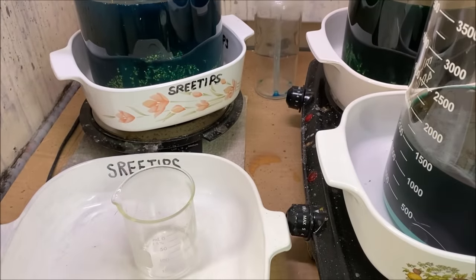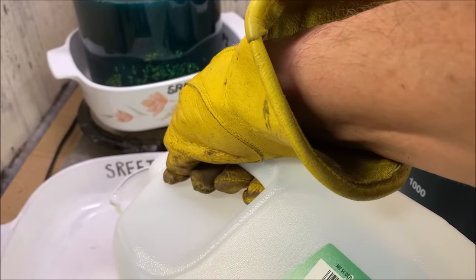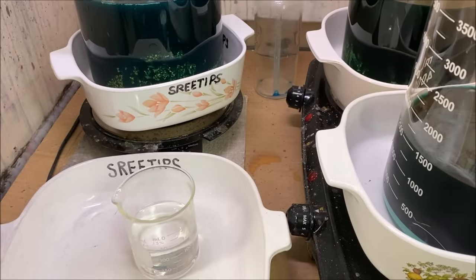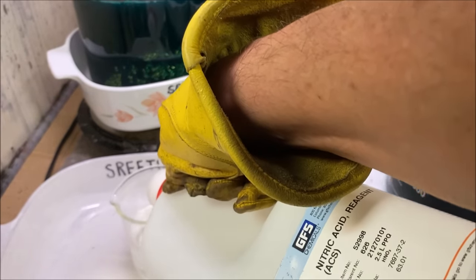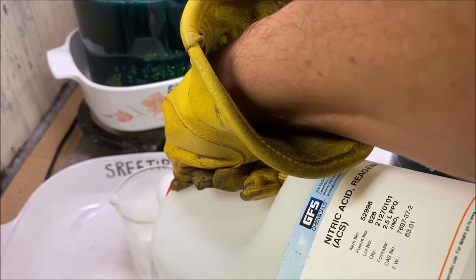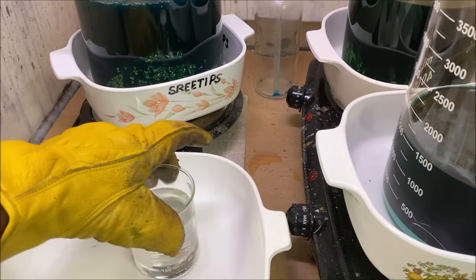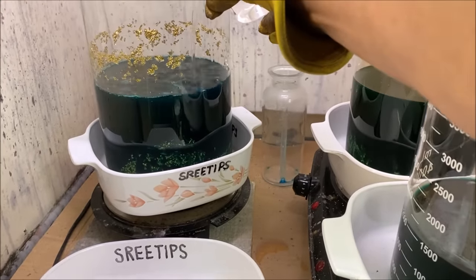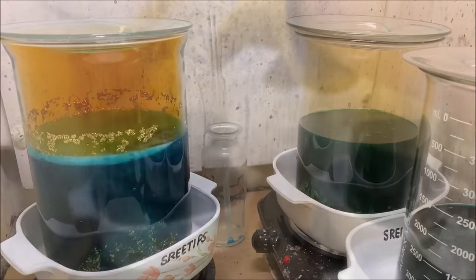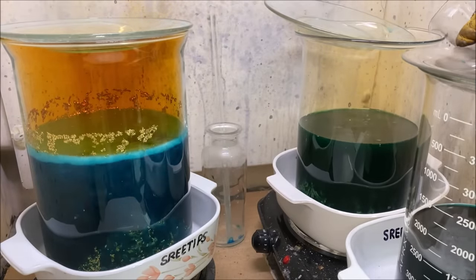Initially I said that this process would take about two 2.5 liter bottles to complete. After recalculating and doing the research after the fact, that's my fault, it's going to take 10 2.5 liter bottles of nitric acid to dissolve this 10 pounds of copper. Some folks may say, "Sri Tips, that's excessive. You should call the experiment and stop right now."